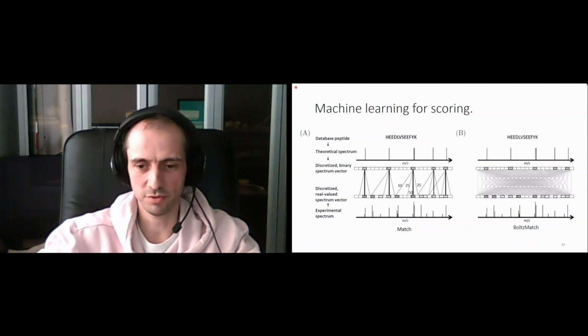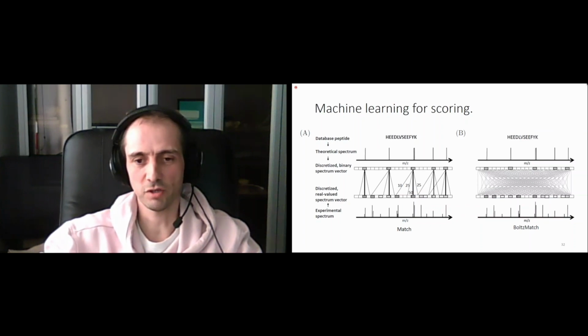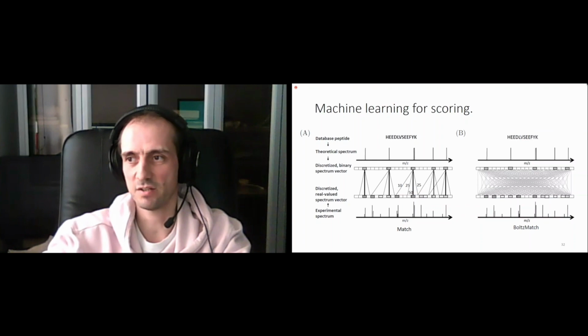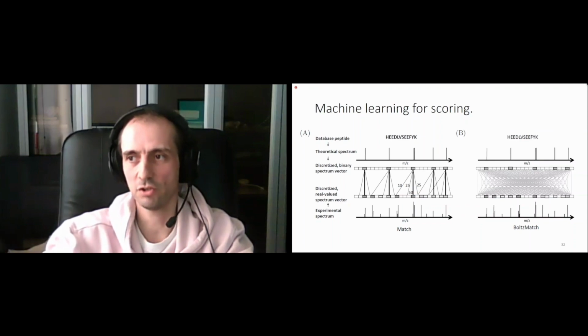You need to adapt the model to your data or the instrument. Yeah. Clearly, it's like in four-wheeler racing. For each track, they adapt the car parameters for the track to get the best performance. If you want to achieve state-of-the-art performance, you need to adapt to the specific task.